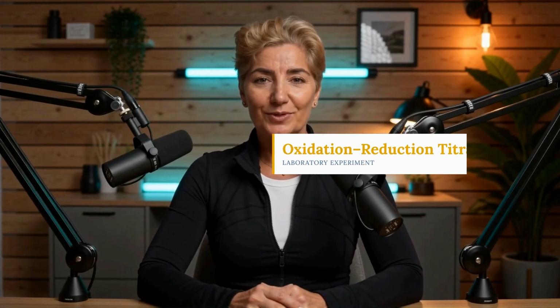Welcome to the oxidation reduction titration experiment. In this laboratory, you will use a redox titration to determine the concentration of an unknown solution. Along the way, you will reinforce important concepts including oxidation reduction reactions, titration, stoichiometry, standardization, and endpoint detection.